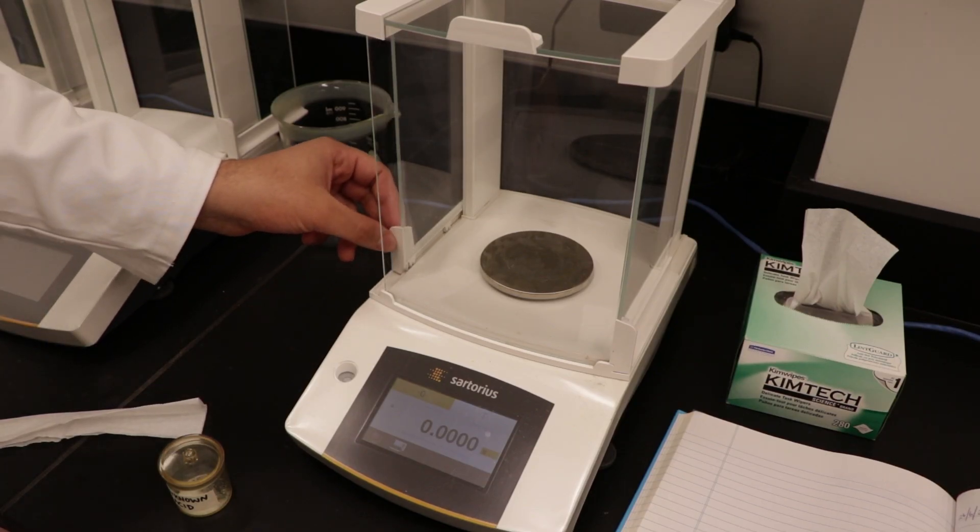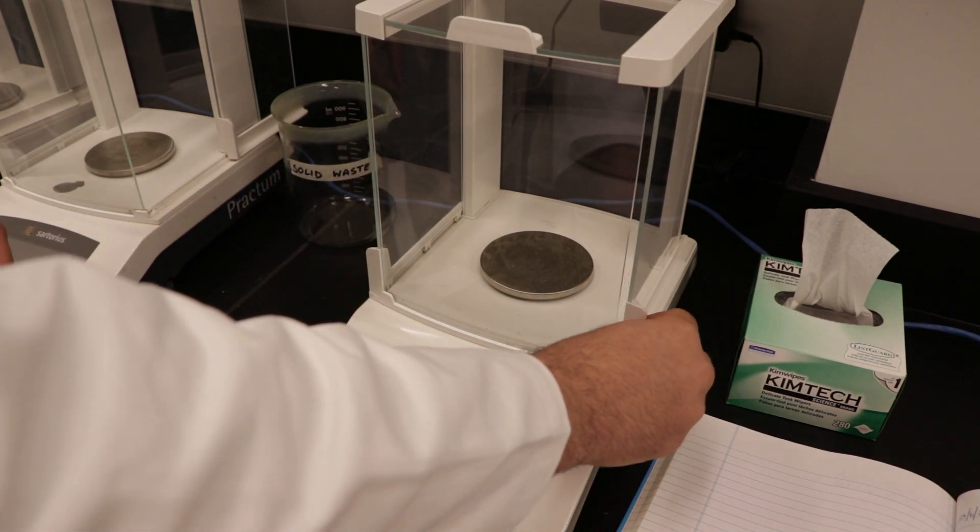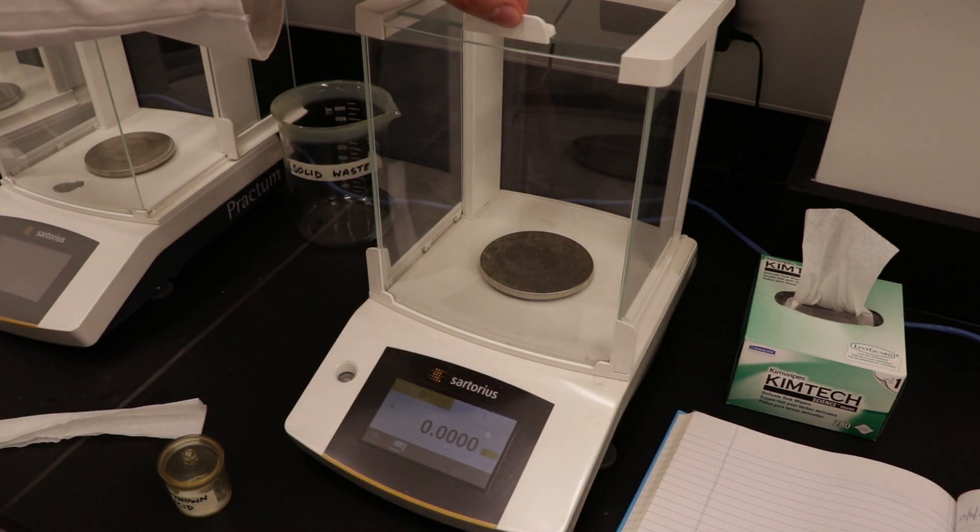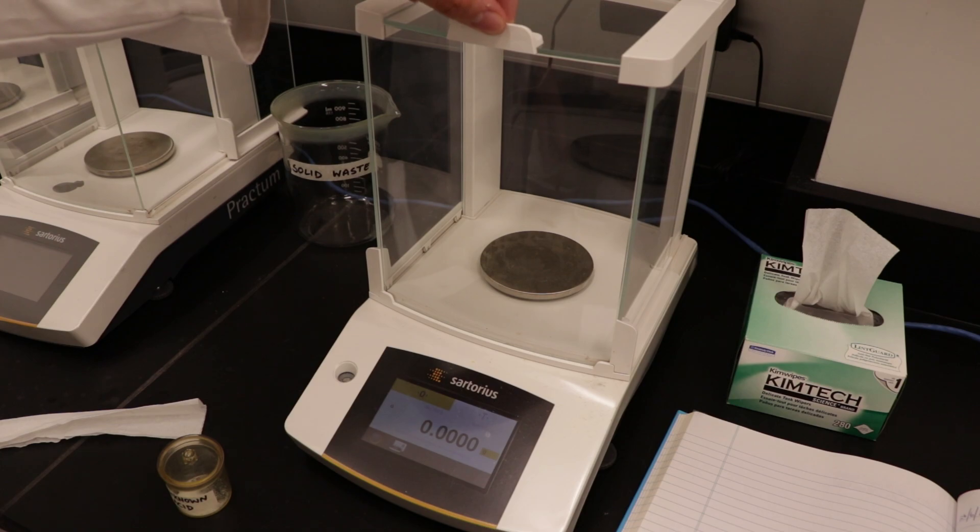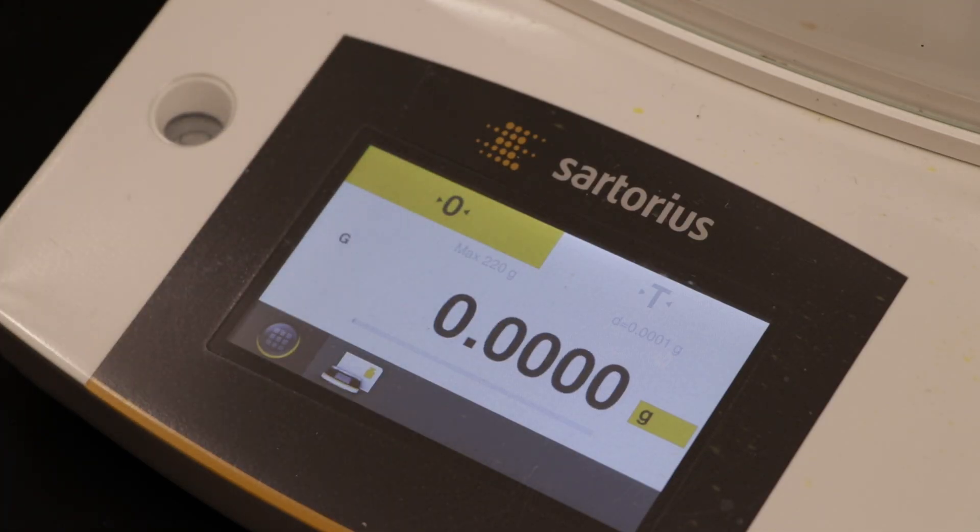Before using the analytical balance, ensure that all doors of the balance are closed and the balance reads 0.000 grams when empty. You may tare the balance if necessary.